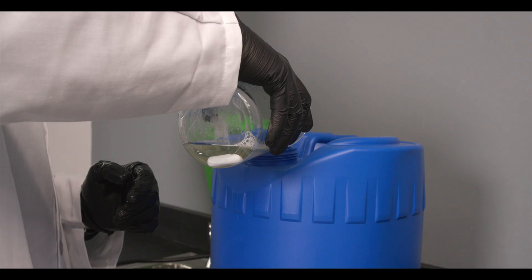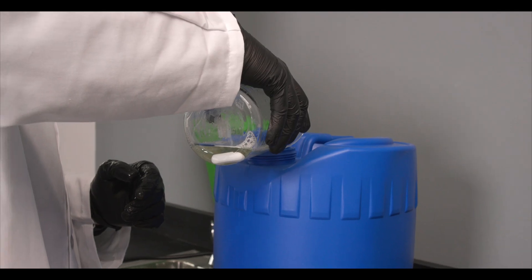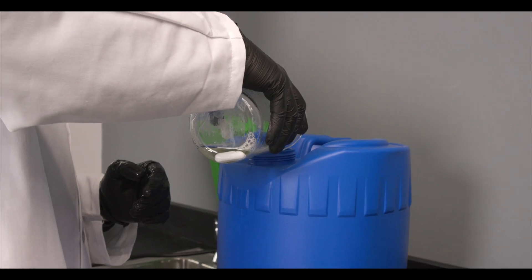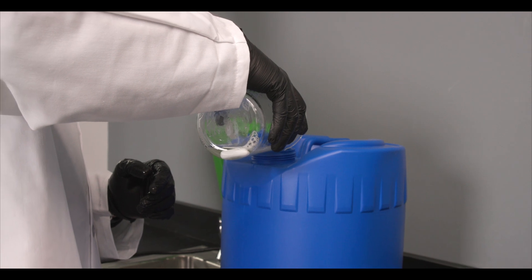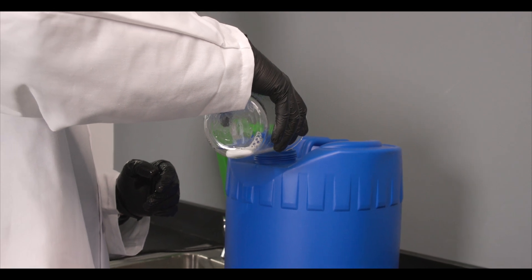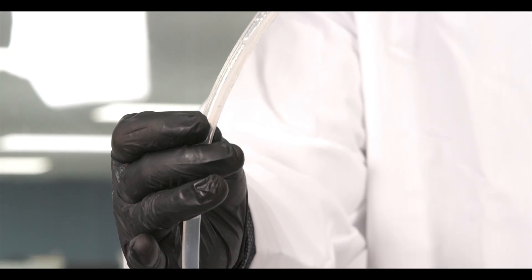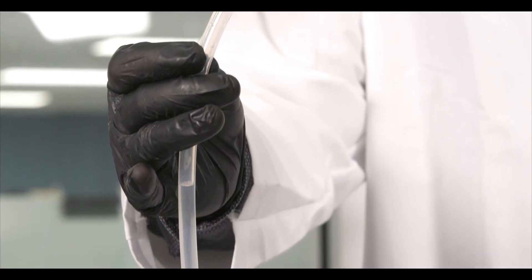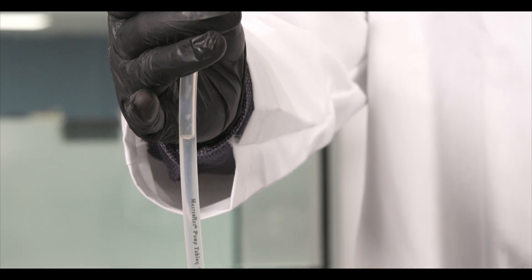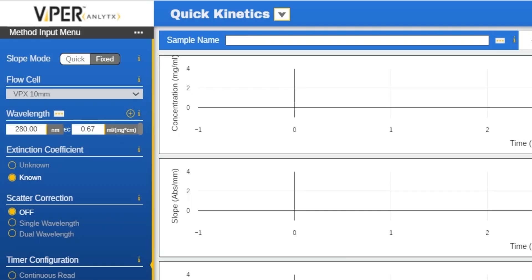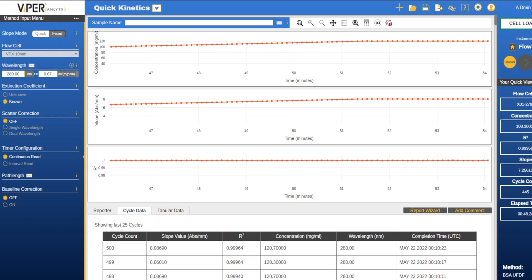And once we've completed our UFDF operation all that is left is to save the data and flush the system with the FlowVPX instrument running to ensure all protein has been removed from the line. The software will automatically save the run to a protected database in the background under the name given to the method. The database ensures data is preserved in the case of sudden power loss.